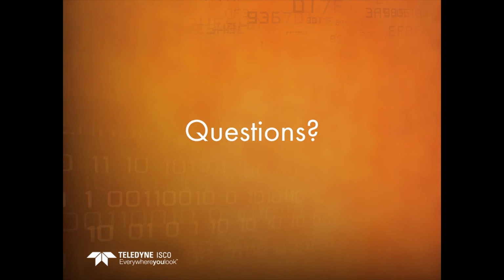So that being said, I'd like to open this up to questions, and I have a few people in the room here. The first question is, can a reciprocating pump withdraw liquids, like fill and refill? Dale Clay: the reciprocating pump has such a small volume that there's not enough volume to really do a refill like syringe pumps. Syringe pump technology is probably a better one to use for withdrawing liquids.